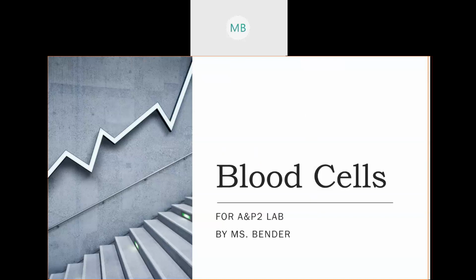You may be shown pictures of that during your lab midterms to know what's clotting, what's not, and to be able to type blood cells. The purpose of this video is not to type the blood, although I will go over the basics of that. This video is so you can identify cells underneath a microscope. And with that, let's get to it.